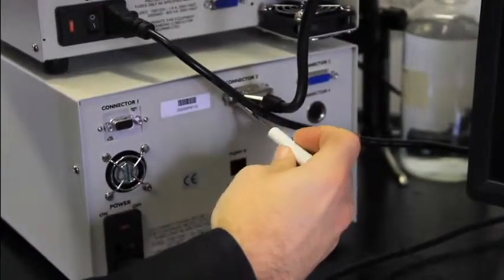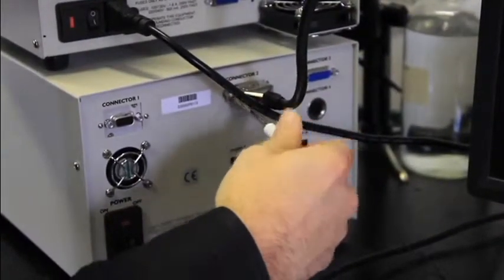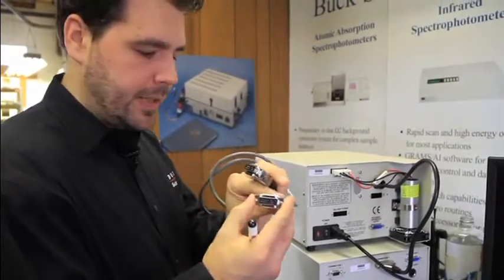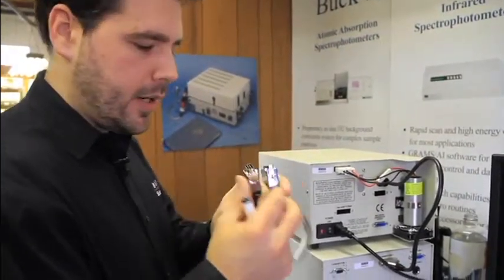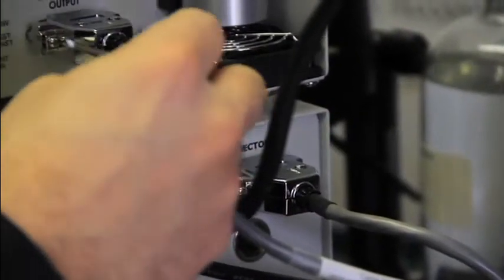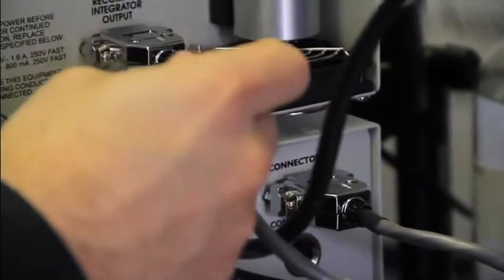The next cable that should be plugged in is the double-headed cable. It has room for 15 pins but there's only about 10 of them in there. One goes in the recorder integrator output and one goes in connector 3 on the pump chassis. Again, these should be screwed in to secure them for connection.